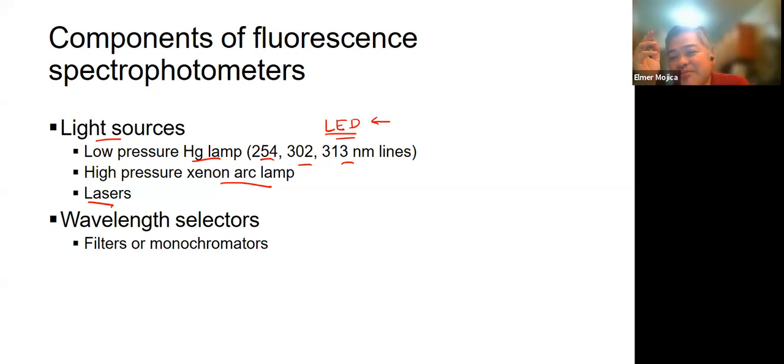It's not as powerful as laser. Okay? But it is more powerful, let's say, than a xenon arc lamp. The problem with the xenon arc lamp is it's broadband, but the power that you have is parang ano lang yan yung parang ganun. Okay? So at some instances or some wavelength, mataas yung power niya, but not at all wavelength. Unlike yung tinatawag nating lasers and this LED, okay, they are specific.